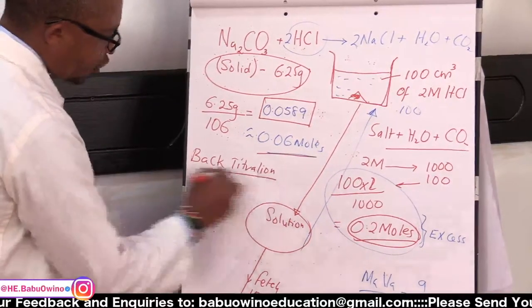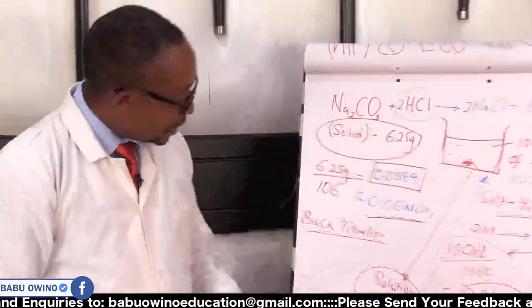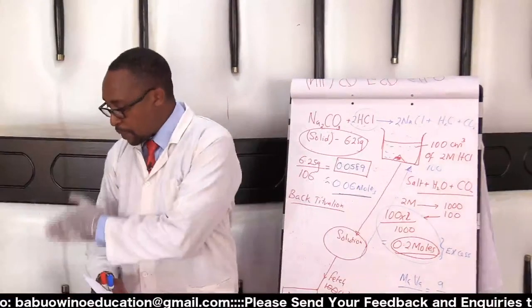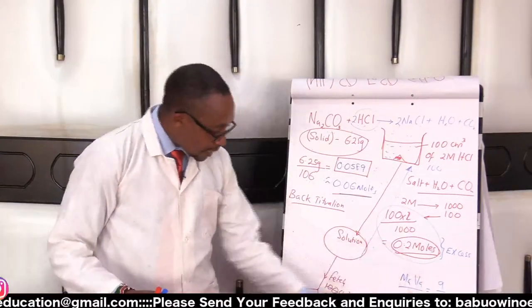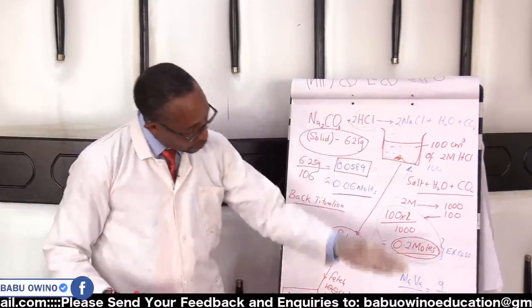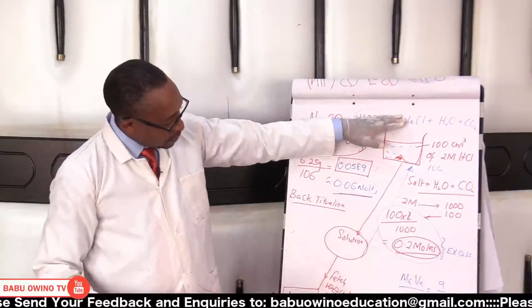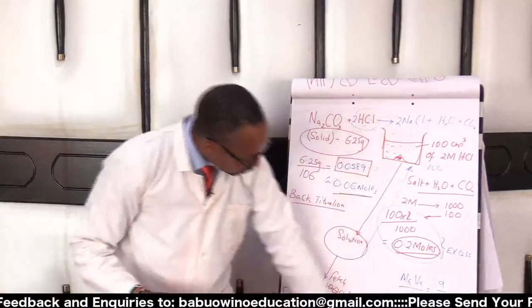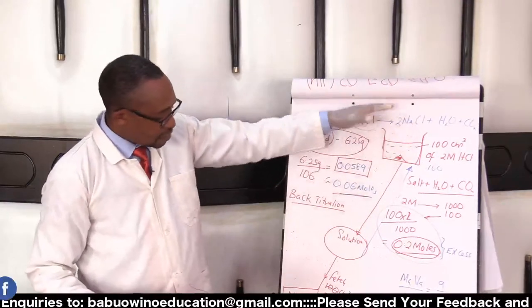So the aspect of back titration is not that you're working back in doing the practical, but back titration is the backness, working from the front, working in reverse, to where you started. So you do all this, then this is where you do the titrations, and then you work back. That is very, very simple.